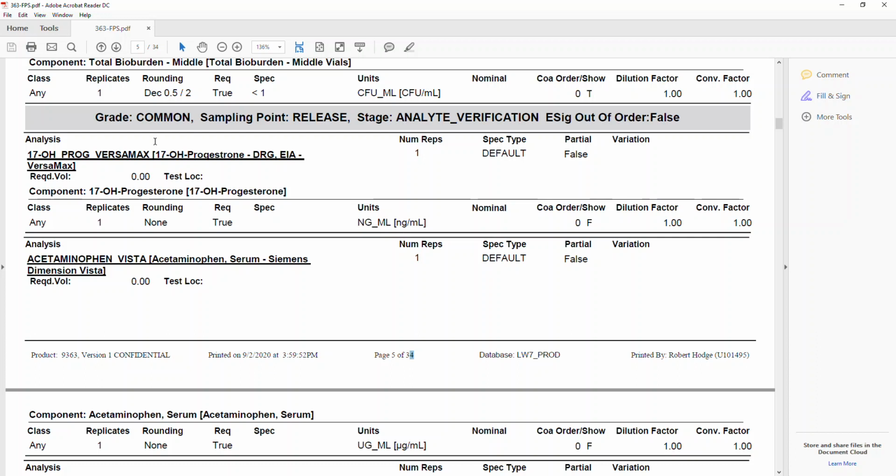So this still applies, that we're using an additional test to calculate the average and not calculate the average within the test. This helps R&D manage their products when they're doing electronic notebook. So they did not want the averages coming along with the test results. So this is why it's built this way.